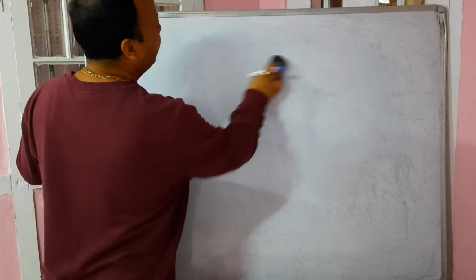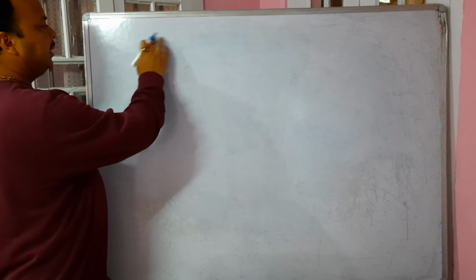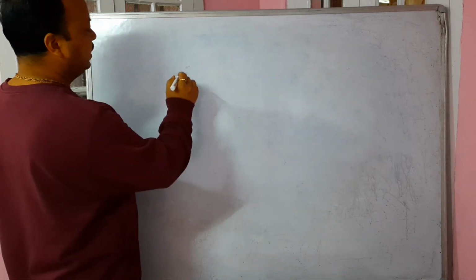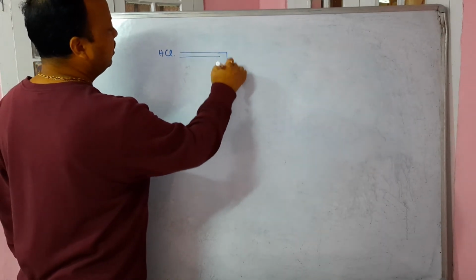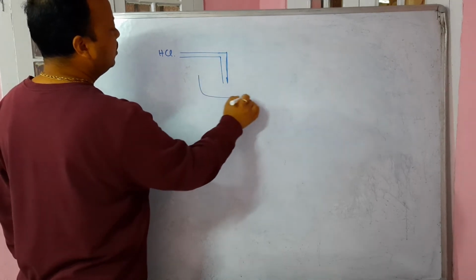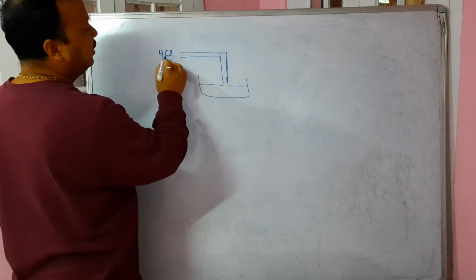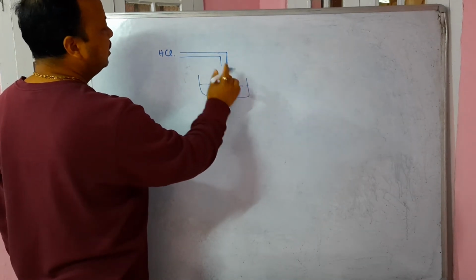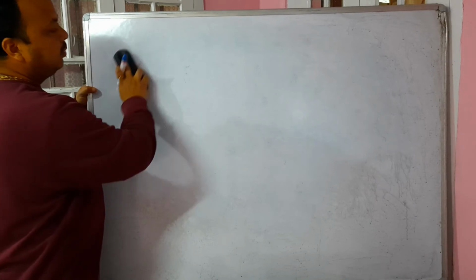So how do we create the aqueous solution of ammonia? This method is almost the same as the preparation of HCl acid. From one of my previous recordings, you must have noticed that when we prepared HCl gas, because it is very highly soluble in water, we kept water in a trough and passed HCl gas. But because the rate at which the HCl is generated and the rate of absorption is so high, we had to change this to an inverted funnel. On the same lines here also, the collection of ammonia to create the aqueous solution of ammonia is the same.